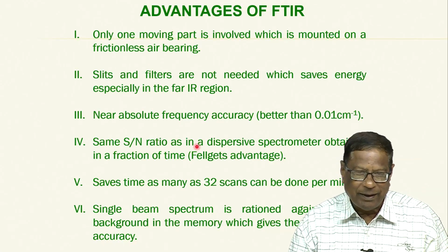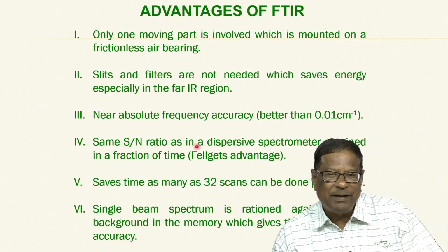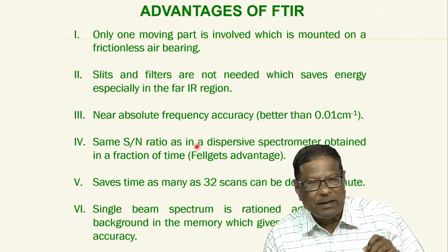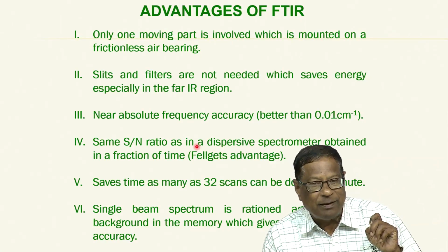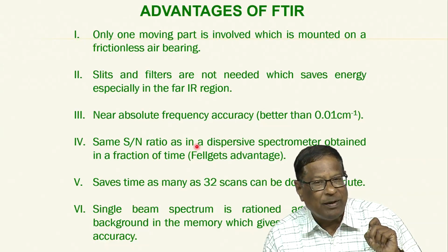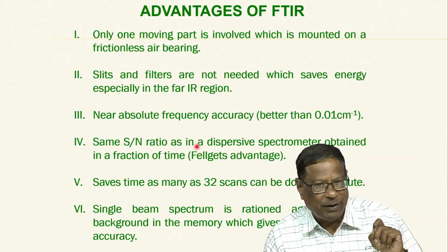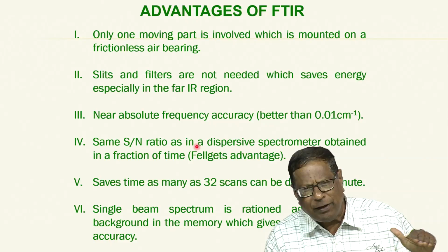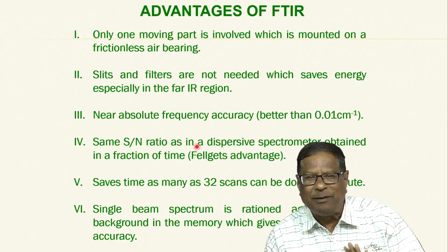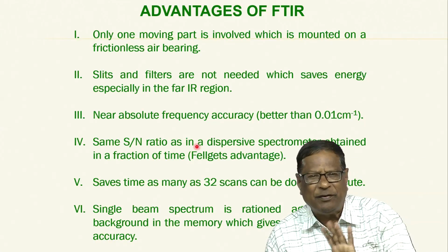So, basically the peak contains noise plus signal. So, for proper measurement, noise should be as less as possible. The noise comes from electrical components. Okay. It is a continuous disturbance of the signal, continuous but fixed.